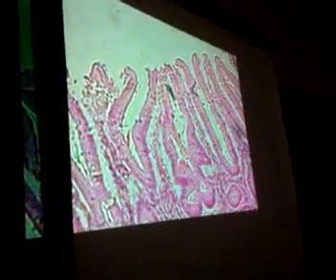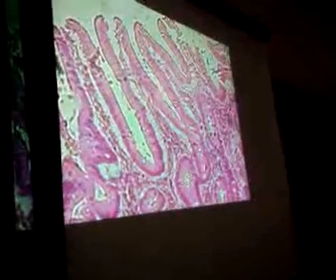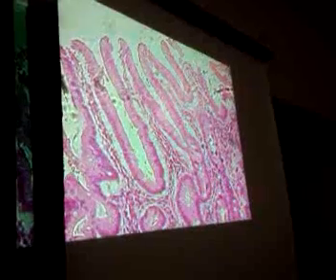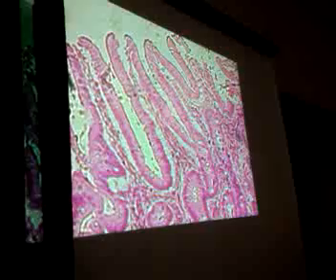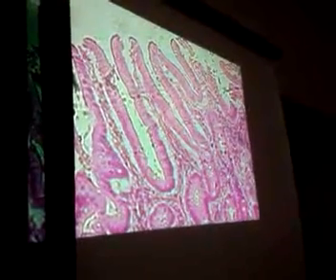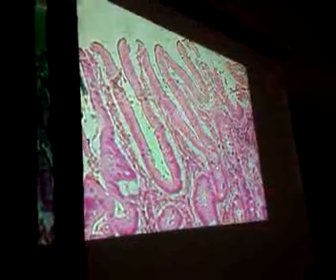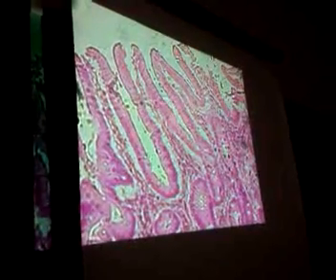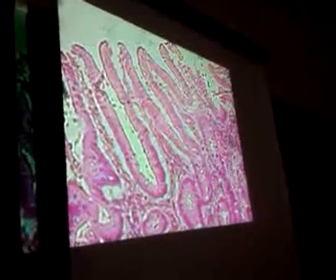You see? That's what that's supposed to be. Are those going to be on the test? Mm-hmm. The goblet cells usually are. They're so easy. And if you look at your slides, you might have better luck. It might look better on yours than this. If you'll look at your slide, I'll come back and check it, and show you a good slide showing this.